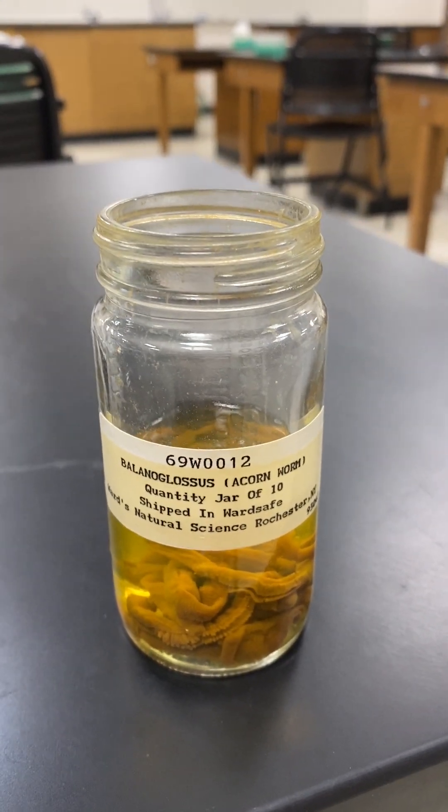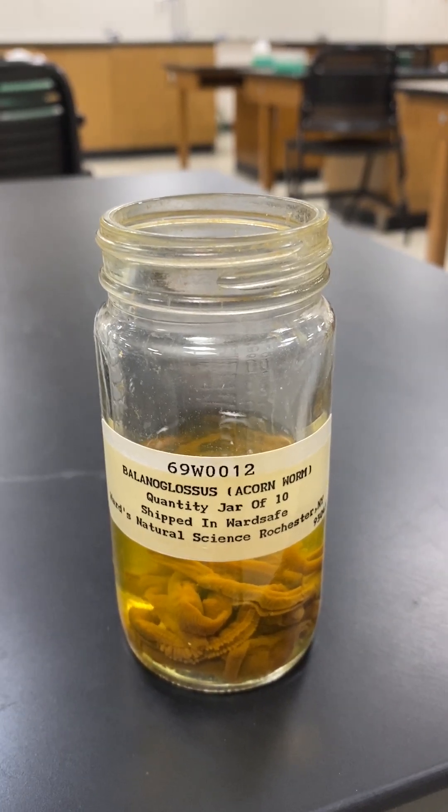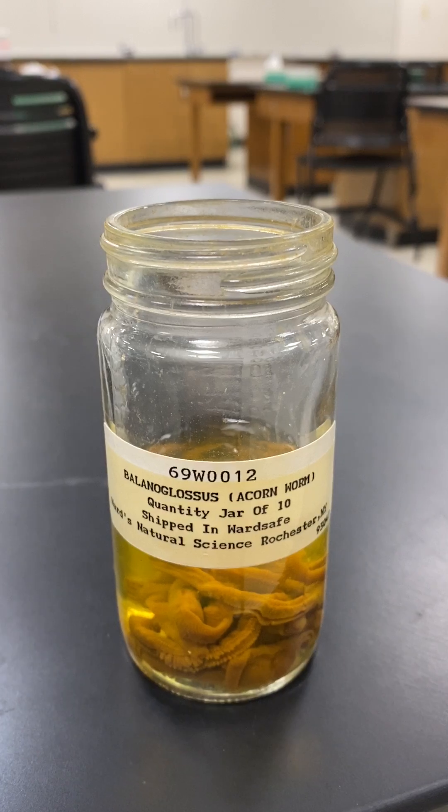Welcome to a walkthrough of the external anatomy of Balanoglossus, which is an acorn worm, phylum Hemichordata, class Enteropneusta.